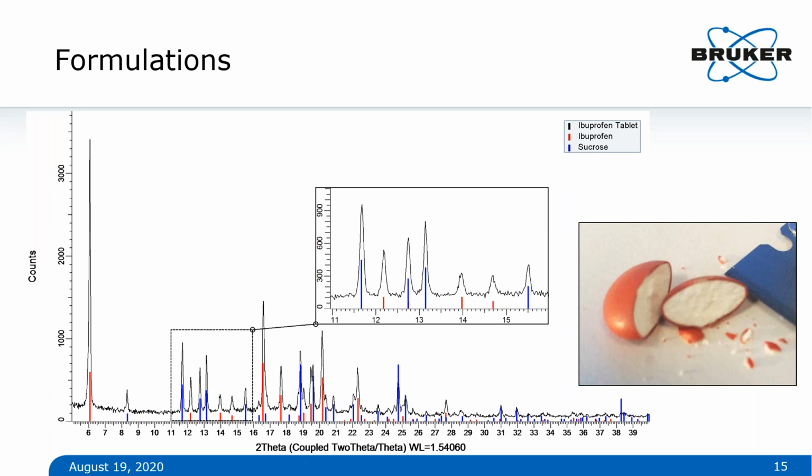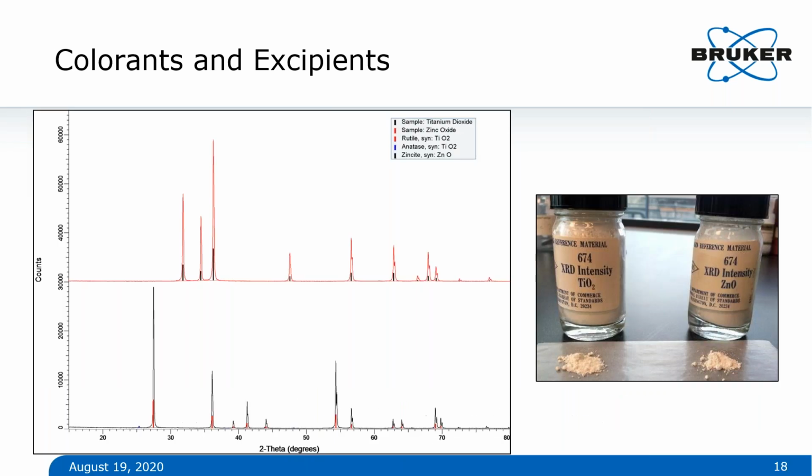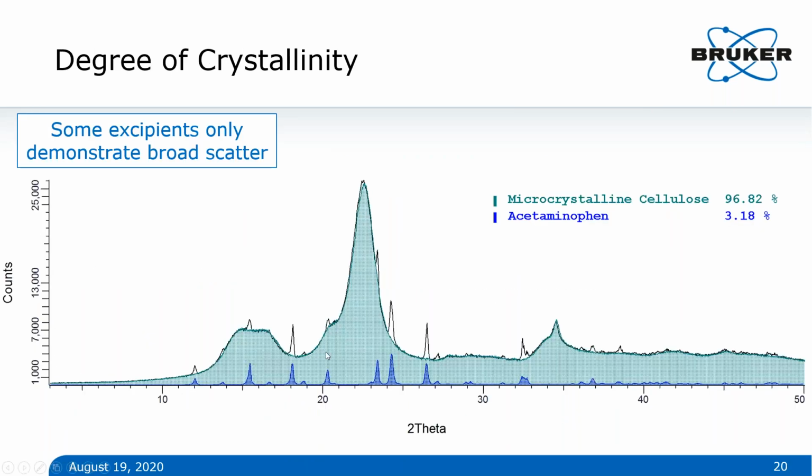Those can give you a handle on trying to get just the other phases, but short of extracting out different phases, it's really hard to remove that effect, to remove all of this amorphous signal that you would get.